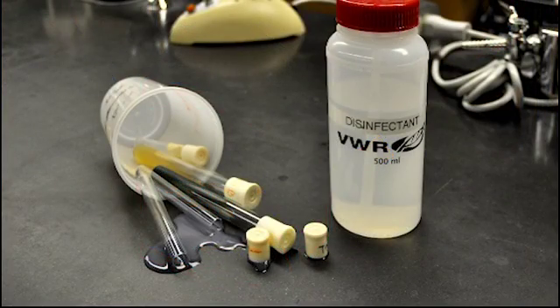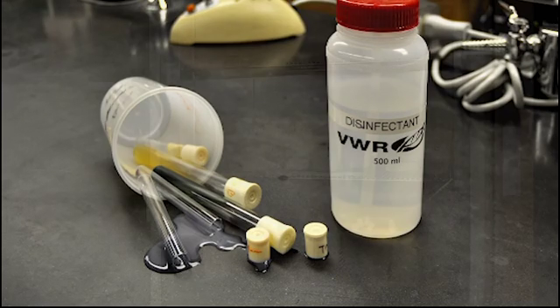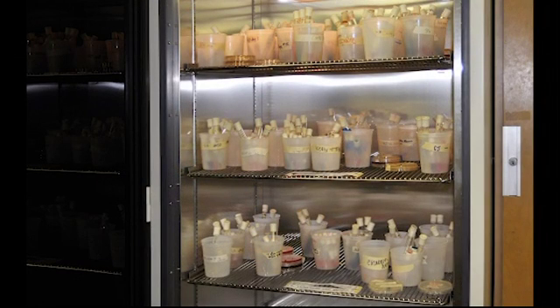Rule number 9. This rule requires you to report any and all spills immediately. Biohazard spills can be very dangerous. Report the accident to the lab instructor immediately and then cover them with disinfectant. Rule number 9 also asks you to exercise extreme care when using incubators and refrigerators to avoid spills.